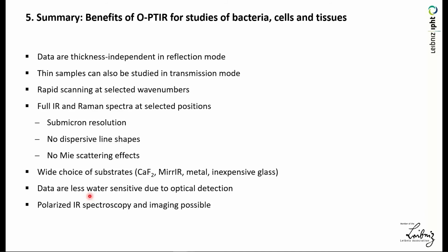So this offers great promise for cell studies, and also polarized infrared data, which is possible because the QCL laser is polarized. So I'm very happy to use the instrument, and I will publish more details in the next months about the examples that I presented today. Thank you for your attention.